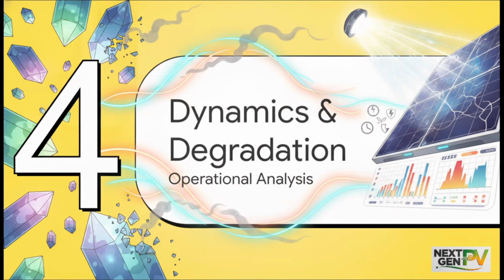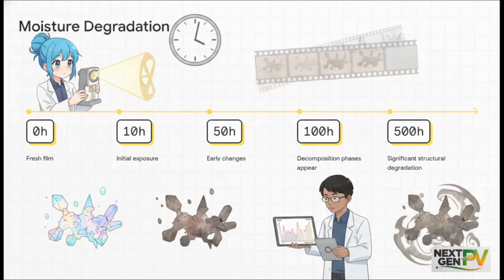Section 4. Tracking degradation and dynamics. Operational analysis. So far, we've really only looked at static films, but tracking dynamic changes, like moisture degradation over a 500-hour timeline, brilliantly illustrates how XRD acts almost like a time-lapse camera for crystal structure.